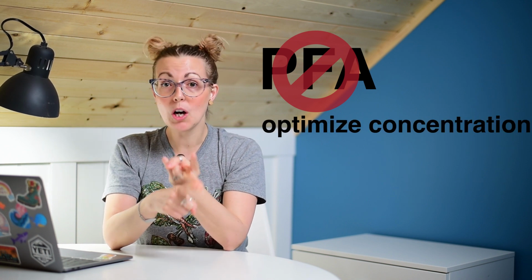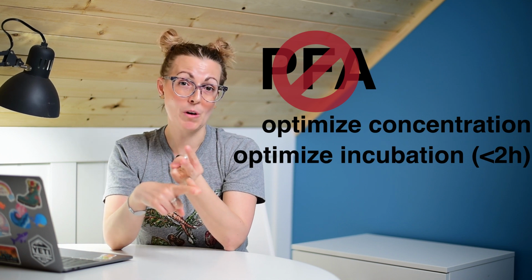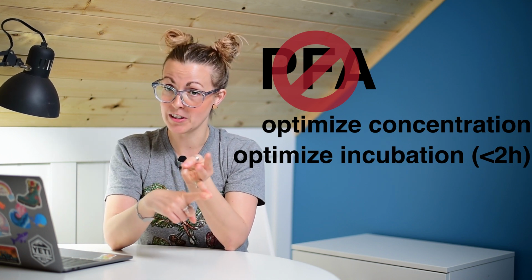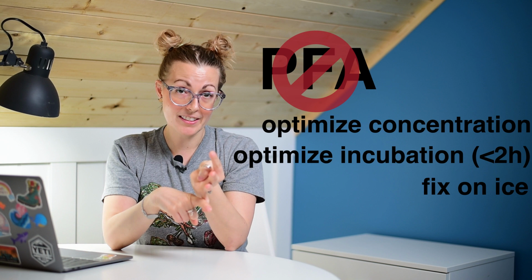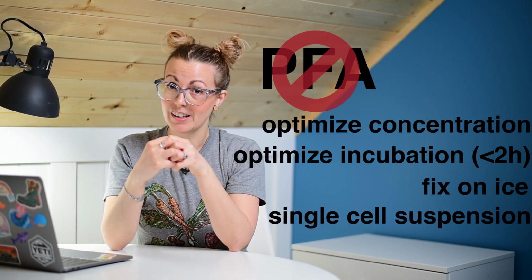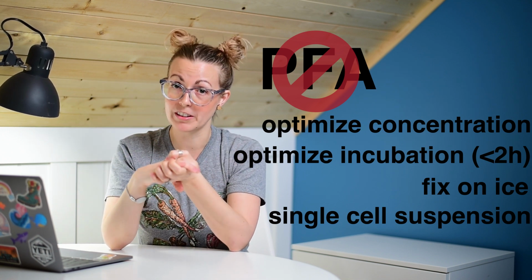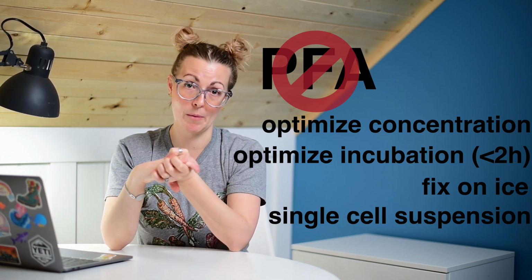So to quickly recap the aldehydes, again, working with formaldehyde, not paraformaldehyde. Keep your concentration as low as possible, but make sure you've tested it. Test the amount of time required, but try to keep it under 2 hours. Always fix on ice, and make sure your cells are single cells so you don't fix clumps together. And doing those things, aldehydes can be very much an important part of your flow cytometry buffer repertoire.